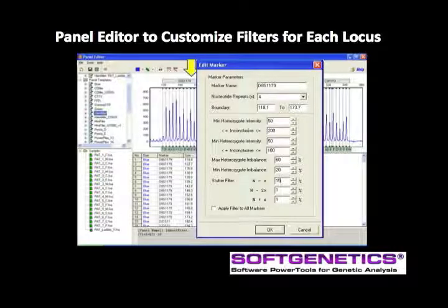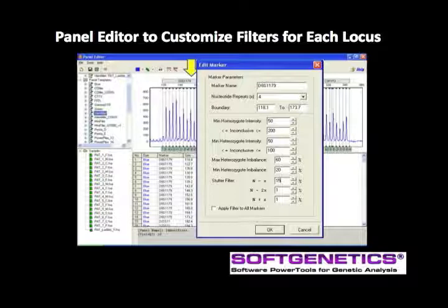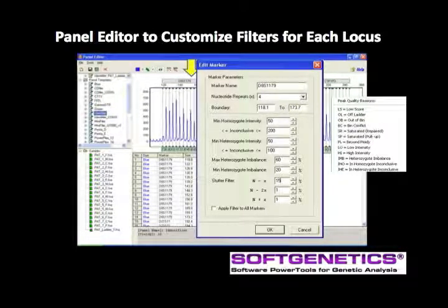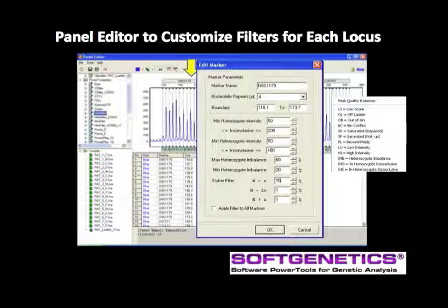The inconclusive range is used for quality flagging of peaks that are above the analytical range of the instrument but may be subject to allele dropout, or the stochastic range. Peaks that are above the minimum intensity and below the inconclusive level will be yellow flagged during the analysis and the quality reason will be IHO or IHE, as seen here in this list of peak quality reasons. Any heterozygous peaks that are below the maximum heterozygous imbalance set for the marker will be flagged yellow with imbalance as the quality reason. Peaks below the minimum heterozygous imbalance are not called; the minimum heterozygous imbalance setting acts as a filter rather than a quality flagging parameter.